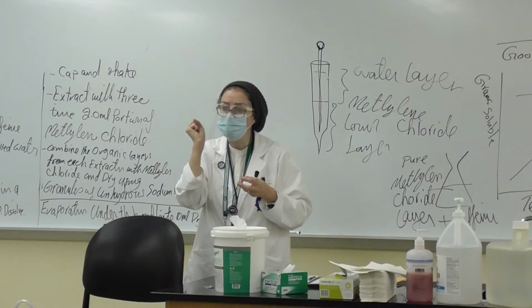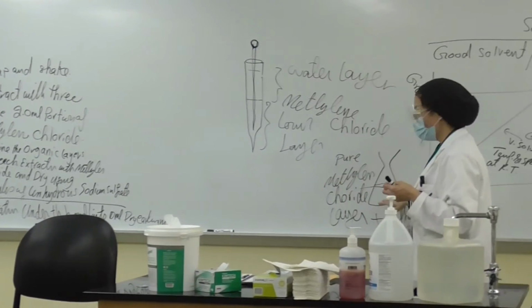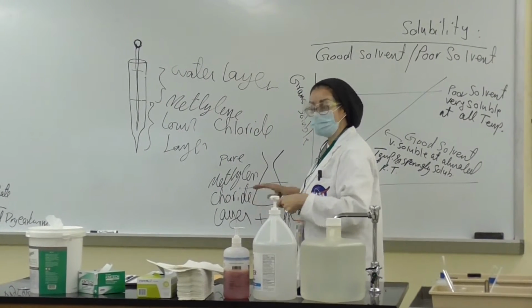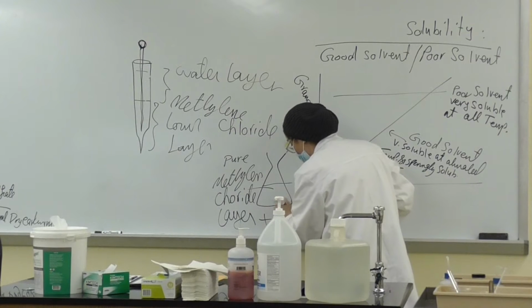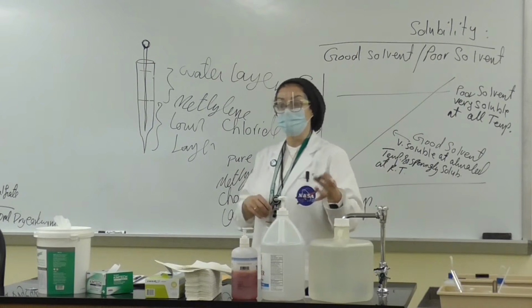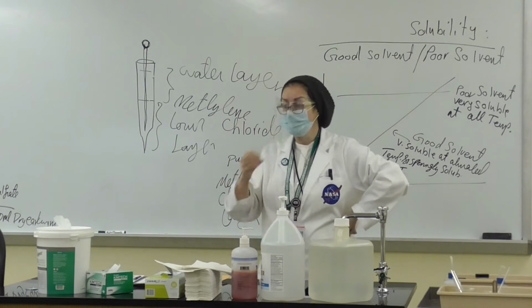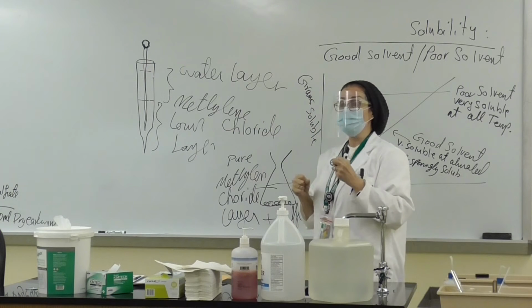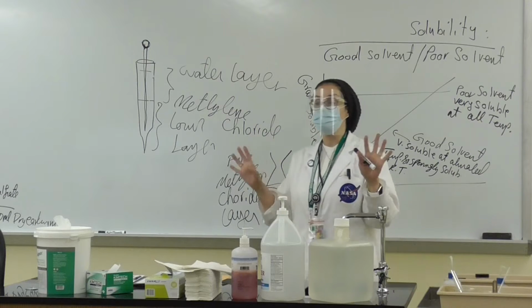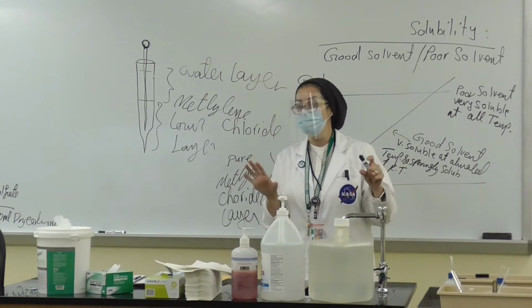It is going to absorb those drops of water, okay? When it is absorbed, it is going to settle at the bottom. And this is now not anhydrous, it is hydrous sodium sulfate, okay? It is going to be clumping over there, absorbing the water molecules, keeping the solution clear and dry. That's the drying step, okay?